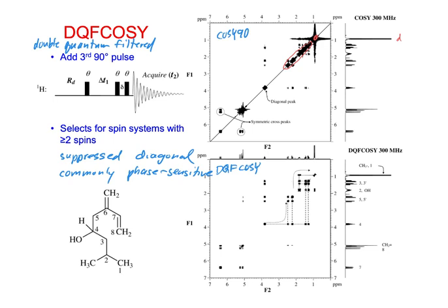But so we have this strong signal here that only has one other spin, and this also has very broad peak shapes down at the bottom, right? And so we see these big tails going in both dimensions. So in this region too, we have some of these tails going off.